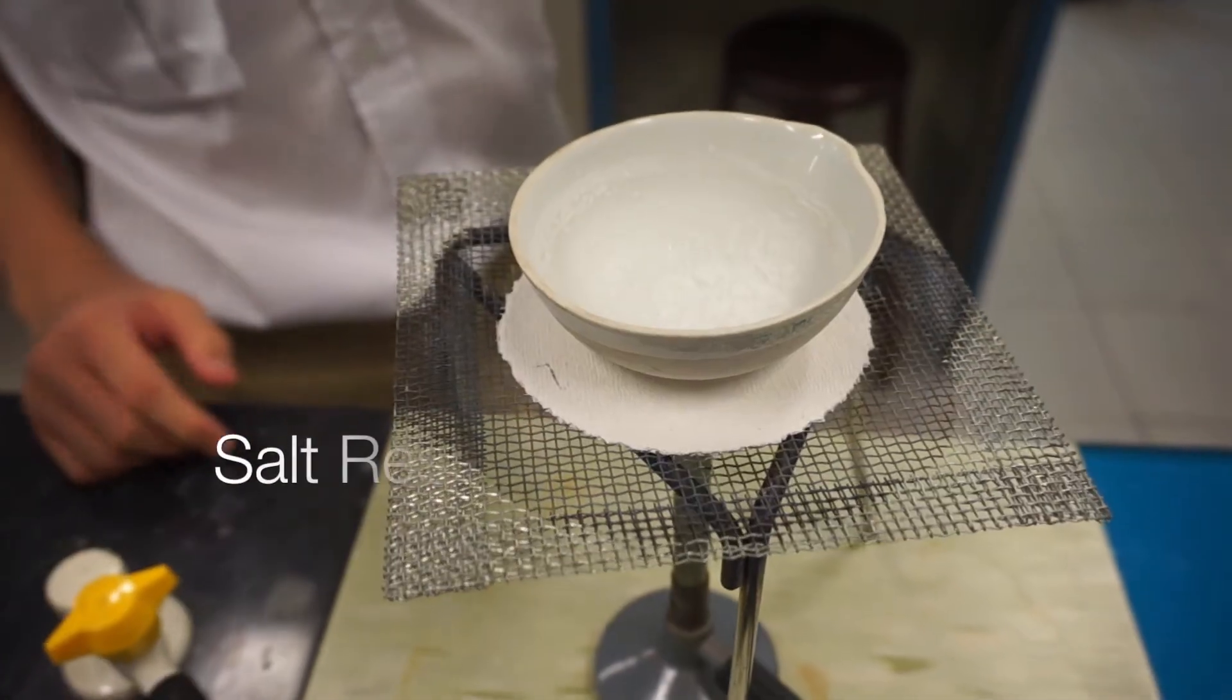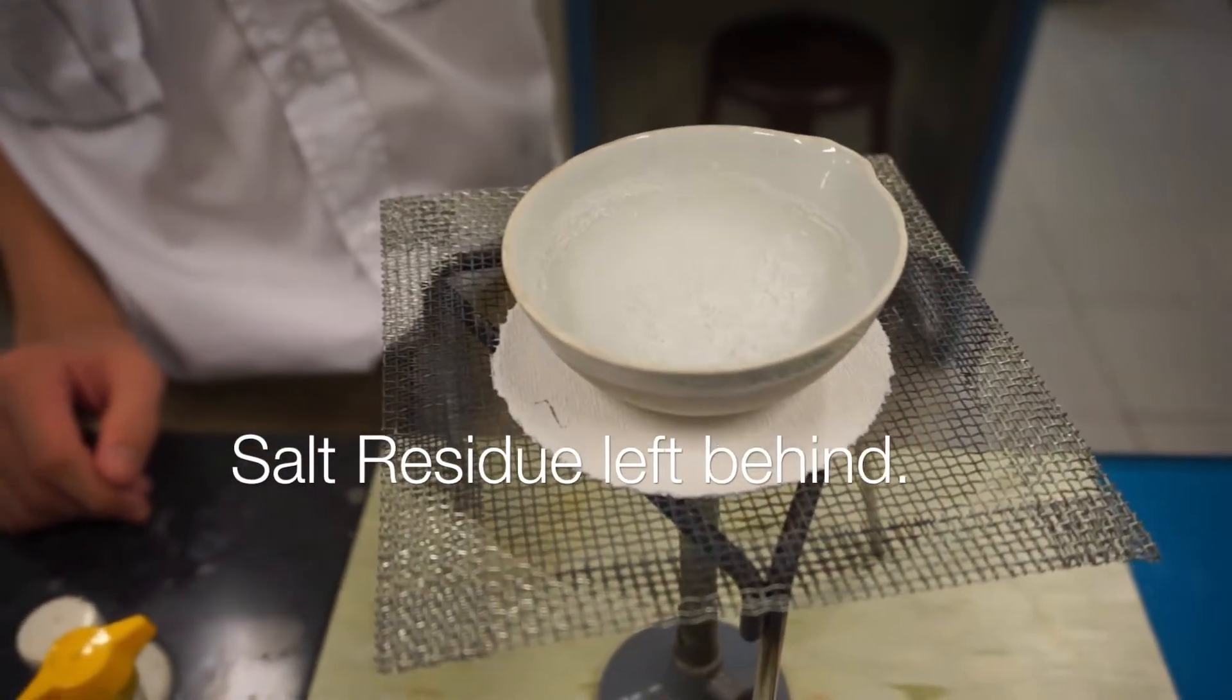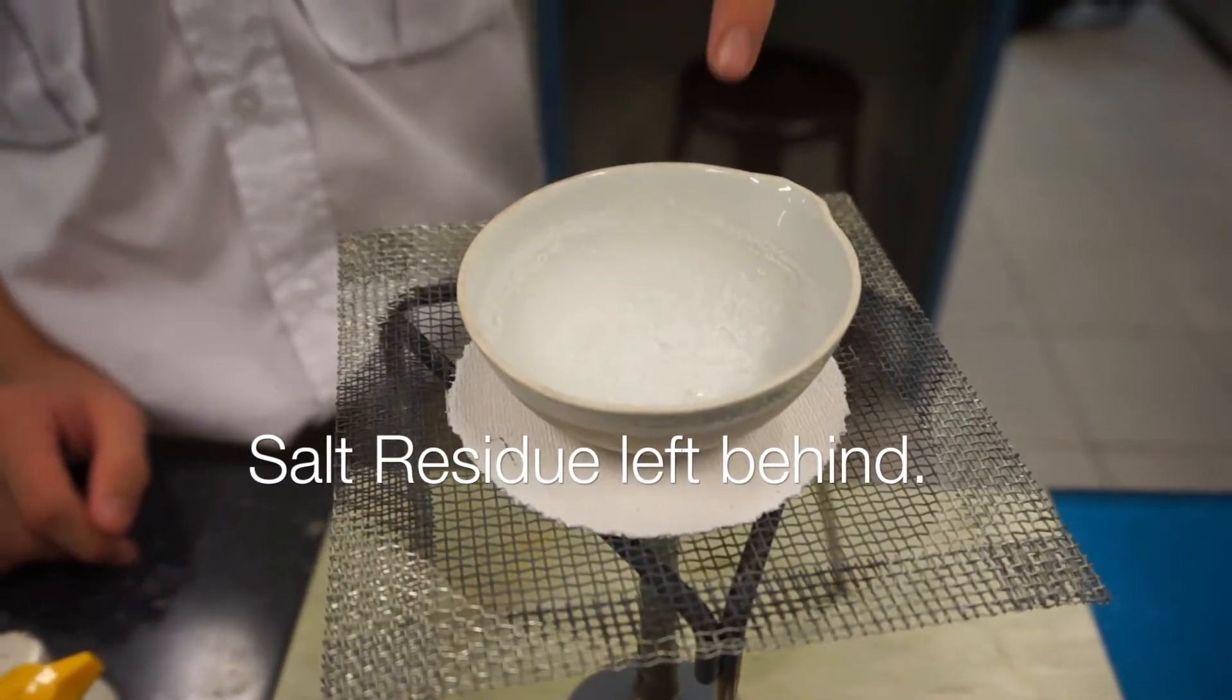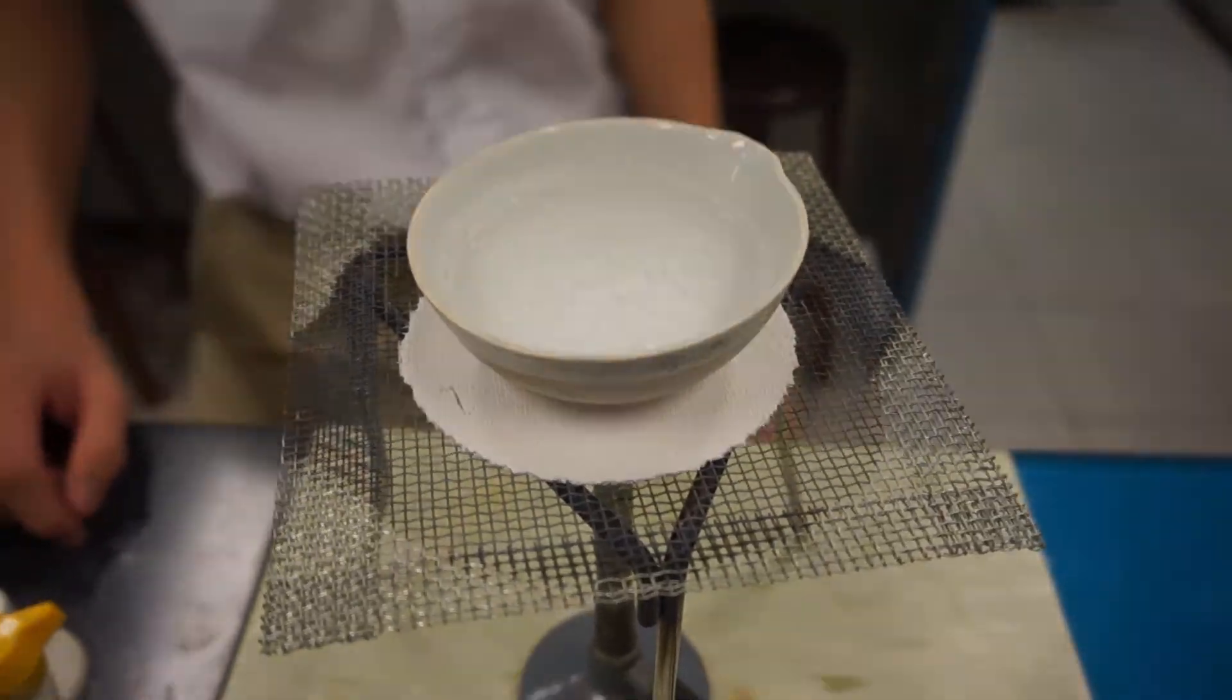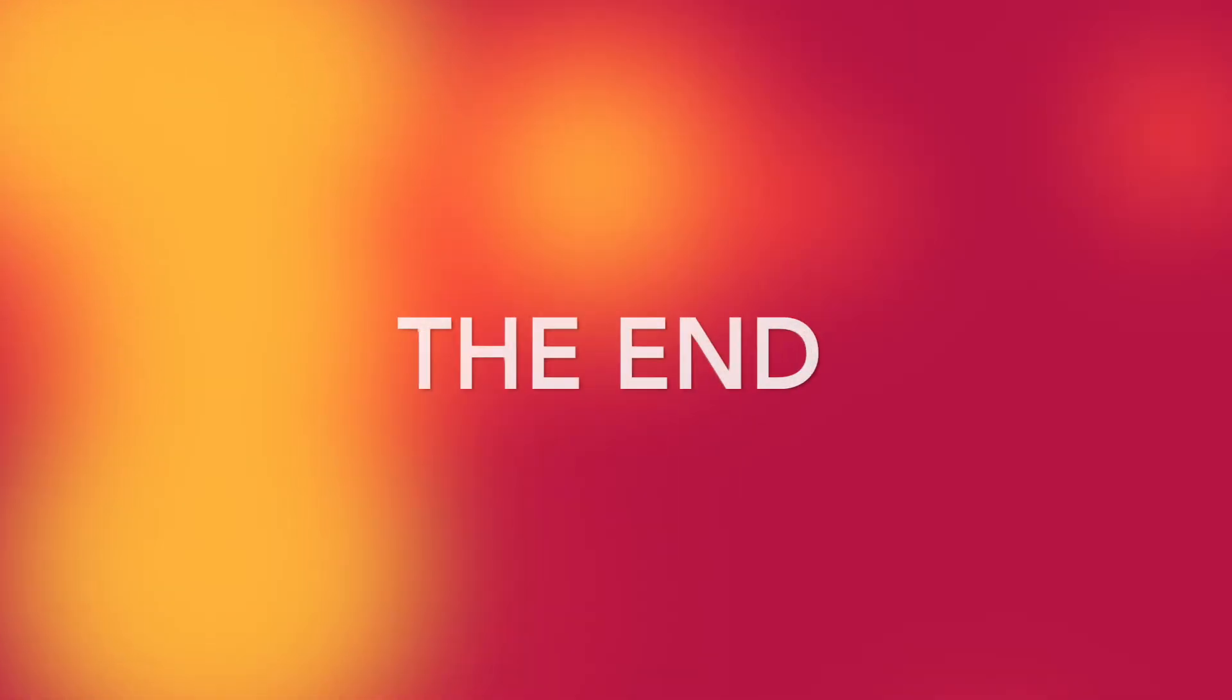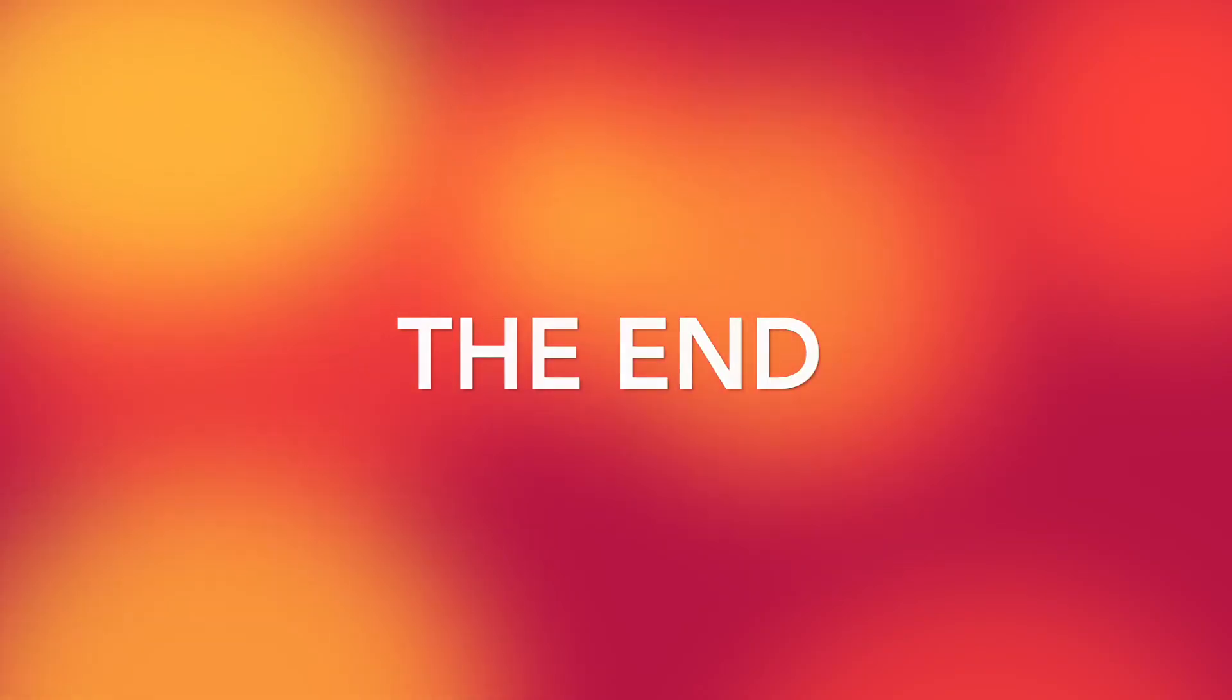As you can see, all the water has evaporated, leaving the salt residue behind. This is how you separate a soluble solid from a solvent using evaporation to dryness.